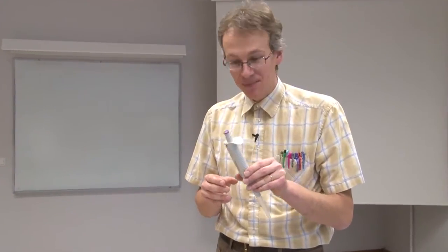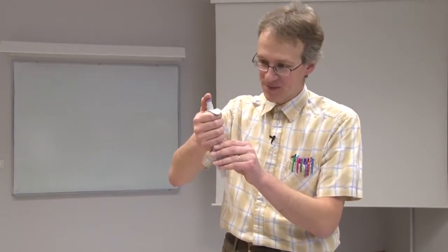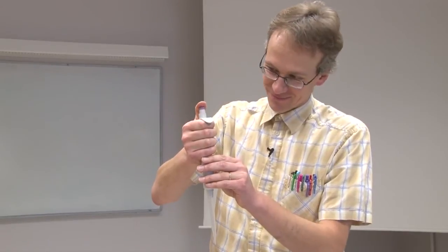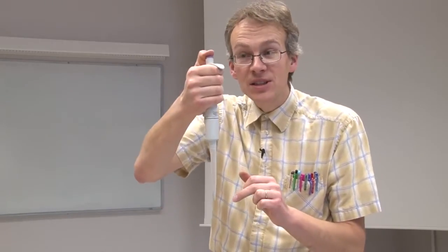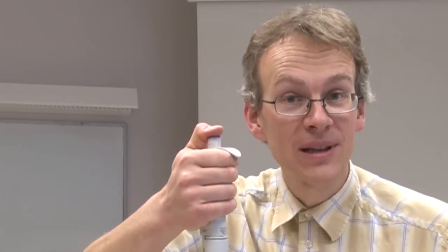Pipetting with an automatic pipette is done using this knob, which has two stops: a first stop and a second stop. If I push to the first stop, exactly the right volume of liquid is delivered. The second stop is meant for emptying the pipette completely. Before taking liquid into the pipette I push to the first stop and release, and when delivering the liquid I push to the second stop and release.